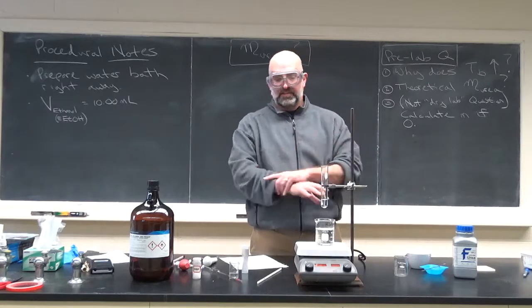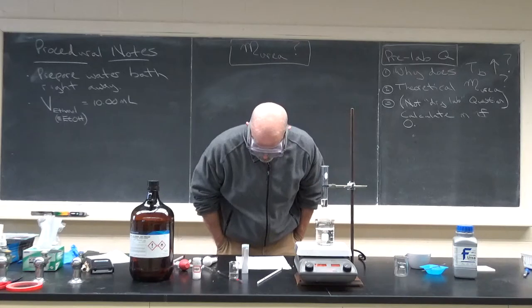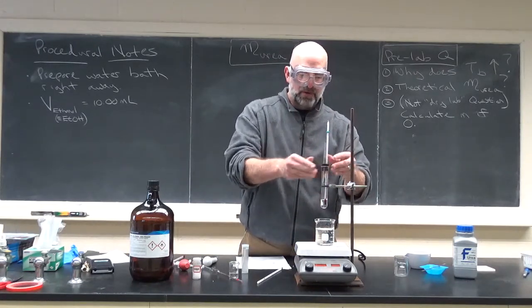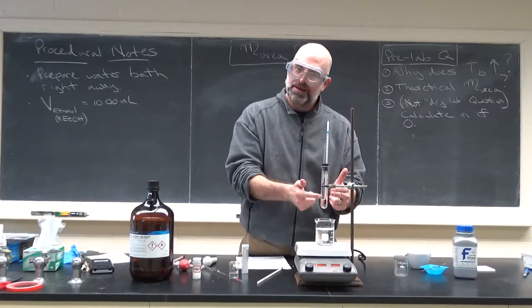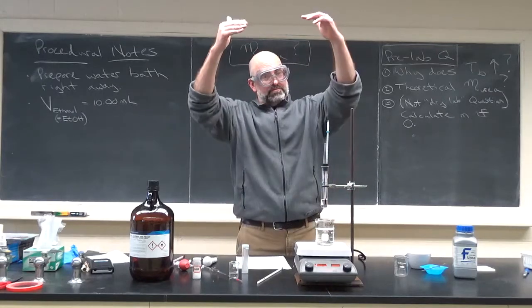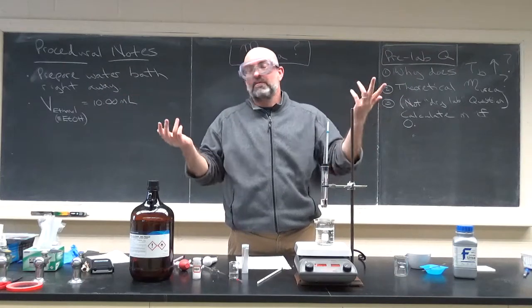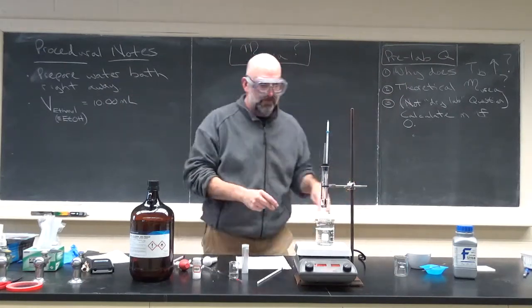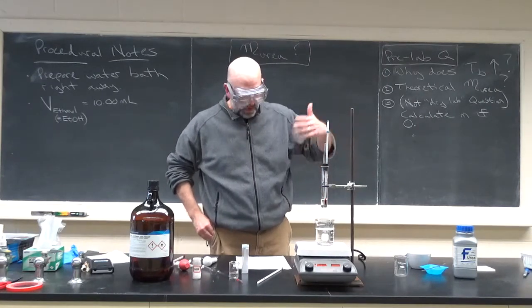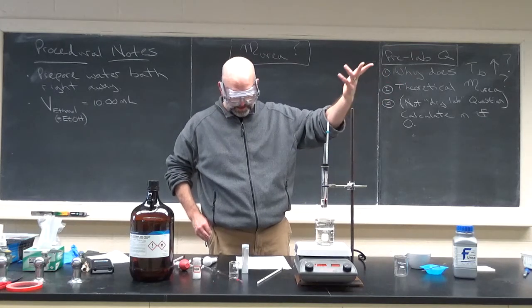We'll see. This lab could be a challenge to do in an hour because it's taking me so long. Okay, so assemble the apparatus, wait till the bubbles come out, steady stream, pull it out, measure the boiling point. It should go up, and it's not going to go up by like 30 degrees or anything. I don't remember what it is. It's only a couple of degrees changed. And that's it. Then what you do is, wash everything. We'll have a waste container over there, and that's the experiment.